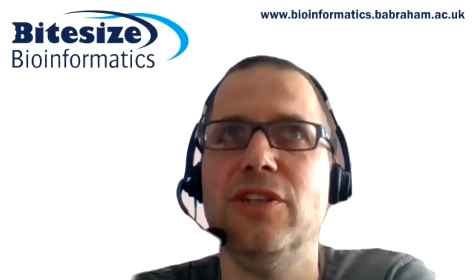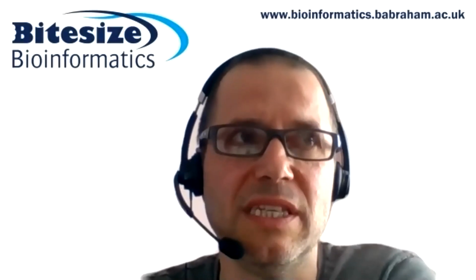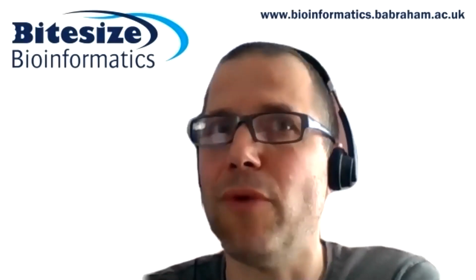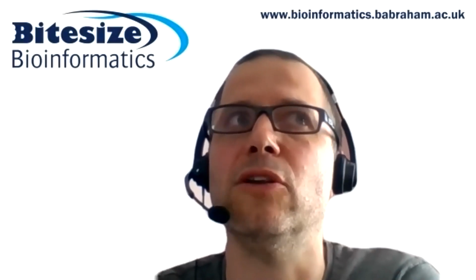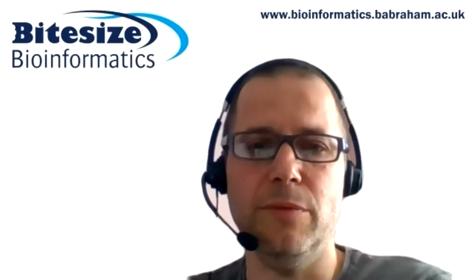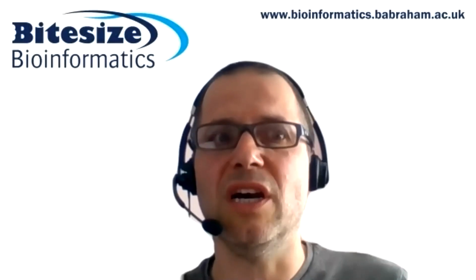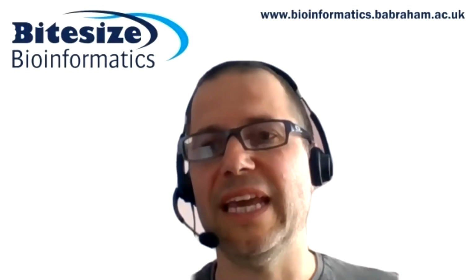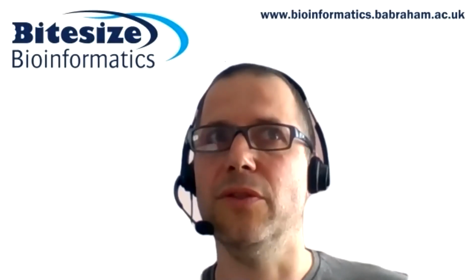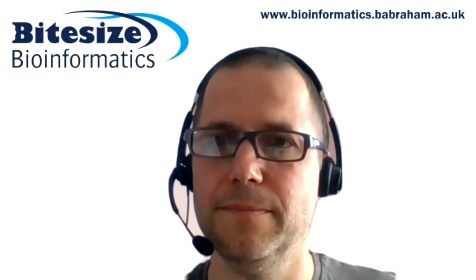It's more efficient if you can merge them in the BAM files before you bring them to SeqMonk. So if you have the option of doing that and you've got the ability to do that, it'll be slightly quicker if you pre-merge them and then import them. But obviously, if you've been given the BAM files and it's all done and you don't have that ability yourself, then you can use data groups to put them together in SeqMonk. But that will be slightly slower than dealing with a data set that's been merged before it came in. Right, thank you. Okay.